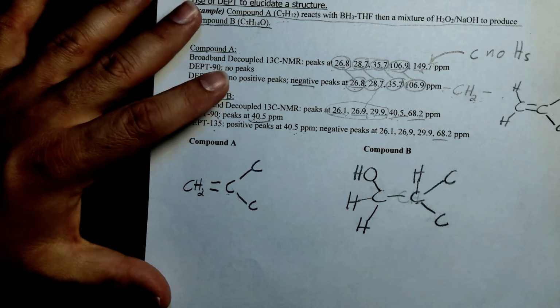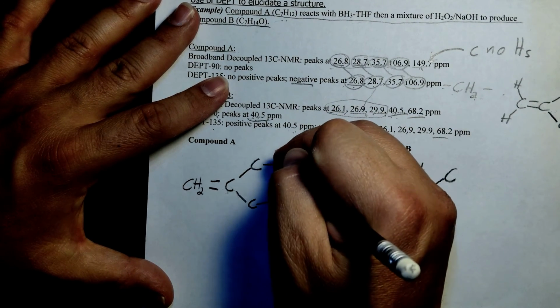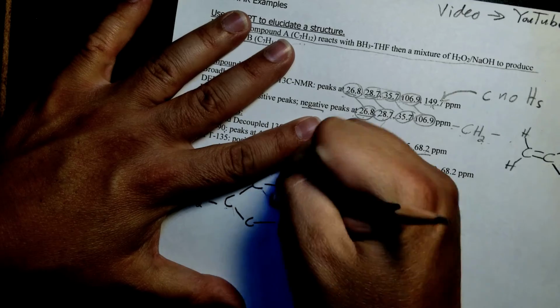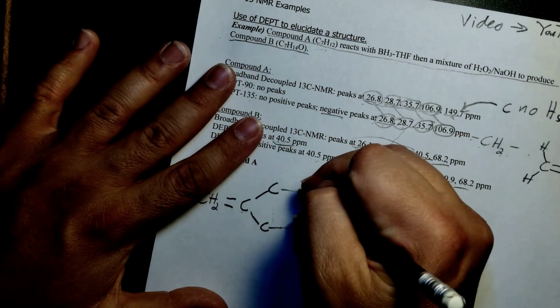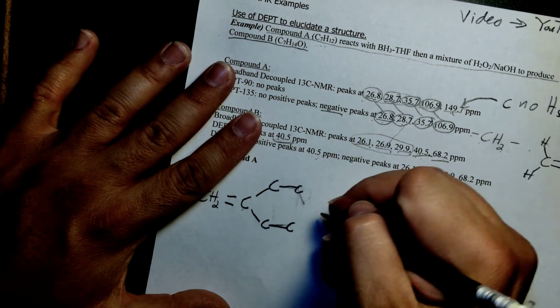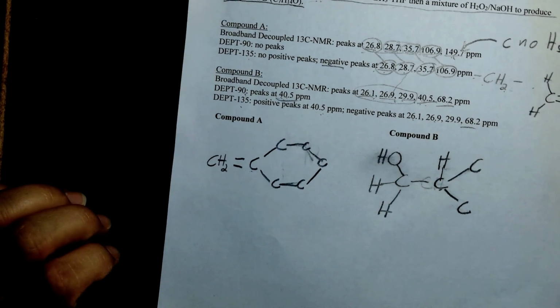There's some symmetry. As I was hinting at, one way to get good symmetry is by having rings.